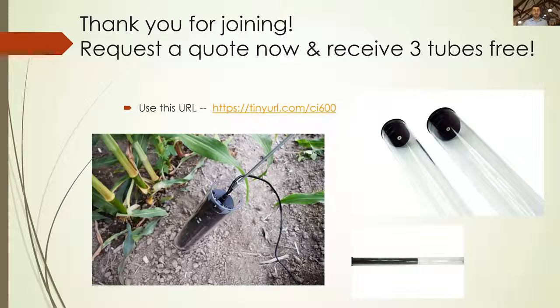Is it practical in pots for alfalfa roots? Very much like the small beds I was showing earlier. We actually have had tested and had other researchers work it and use it in pots. It just depends on how you put it in that acrylic tube. So if you have the tube go straight through the pot, have the pot here and have the alfalfa grow around it, that's one method. You can do it diagonally. Honestly, every time I think that we've run out of ways to do it, I see somebody else come up with a new method.